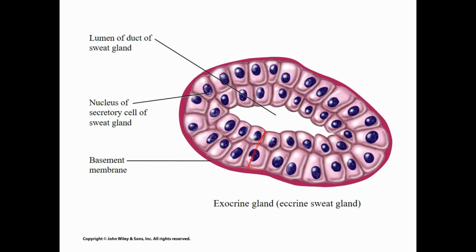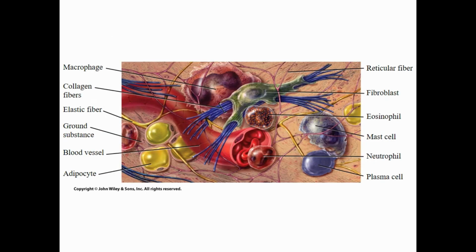And I will ask again, identify. I will actually have in the question the words epithelial tissue. So if you see epithelial tissue, then you know we're looking for stratified squamous, simple columnar, something along those lines. If I want connective tissue, I'll ask, what kind of connective tissue is this? So as not to make things more confusing for you than they already are.